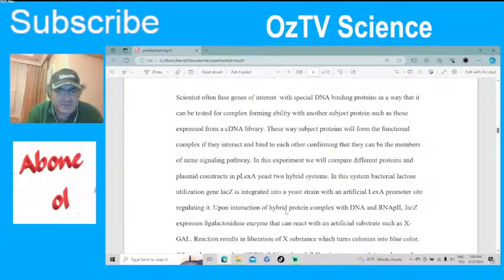That's why it's called yeast two-hybrid. You're just trying to understand the relation between proteins. In this experiment, we will compare different proteins and plasmid constructs in the pLexA yeast two-hybrid system. So that's the name of the gene, LexA.